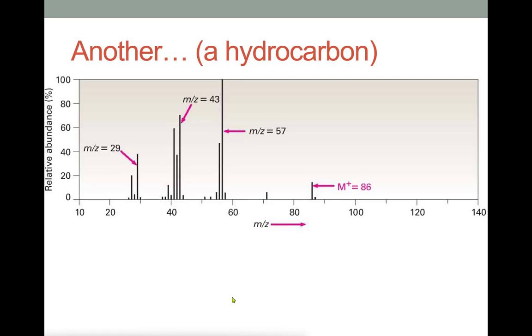Essentially, you can think about this molecule, if it's 6 carbons in a row with all the accompanying hydrogens, getting clipped off. Well, did I break between carbon 1 and 2? Then I would get this peak and a 15 that I happen not to see here. If I broke between carbons 2 and 3, I would get this peak plus this peak. If I broke between carbons 3 and 4, I would get 2 peaks the same, at half the molecular weight each. And so I see that straight, progressive change in the molecule. It's indicative of a straight chain hydrocarbon.